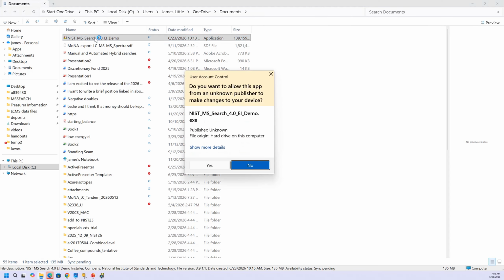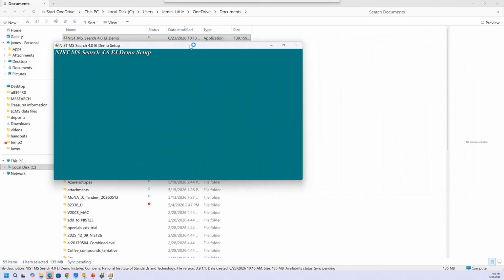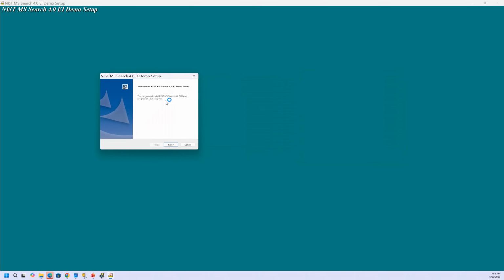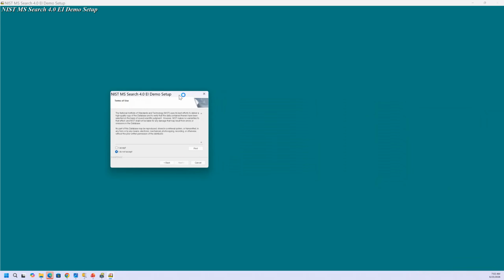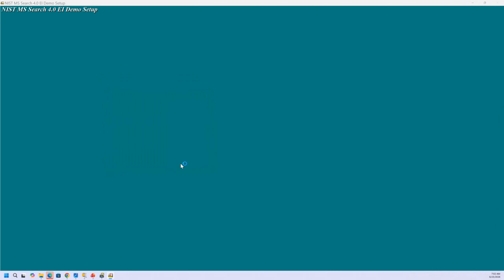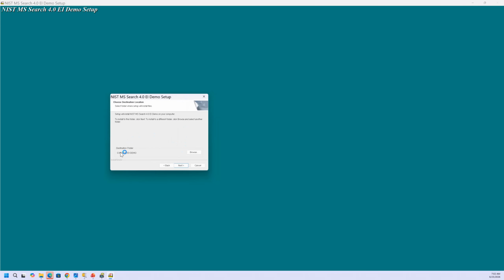Start the installation. Say yes. Next. I accept. This is where to put it, so I'll take the default.